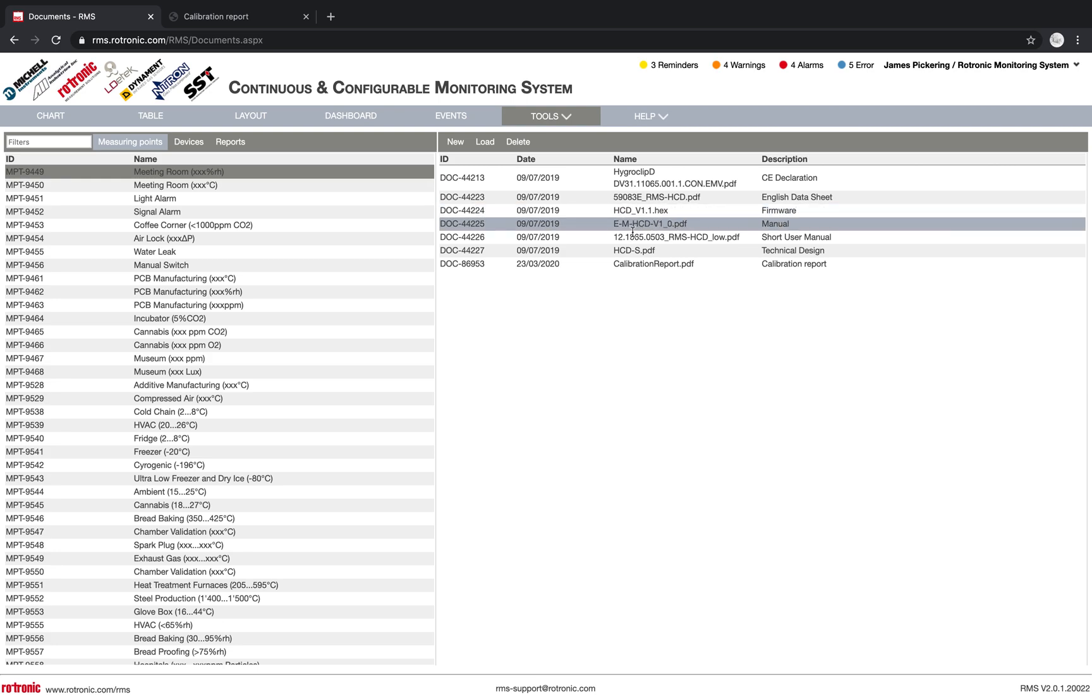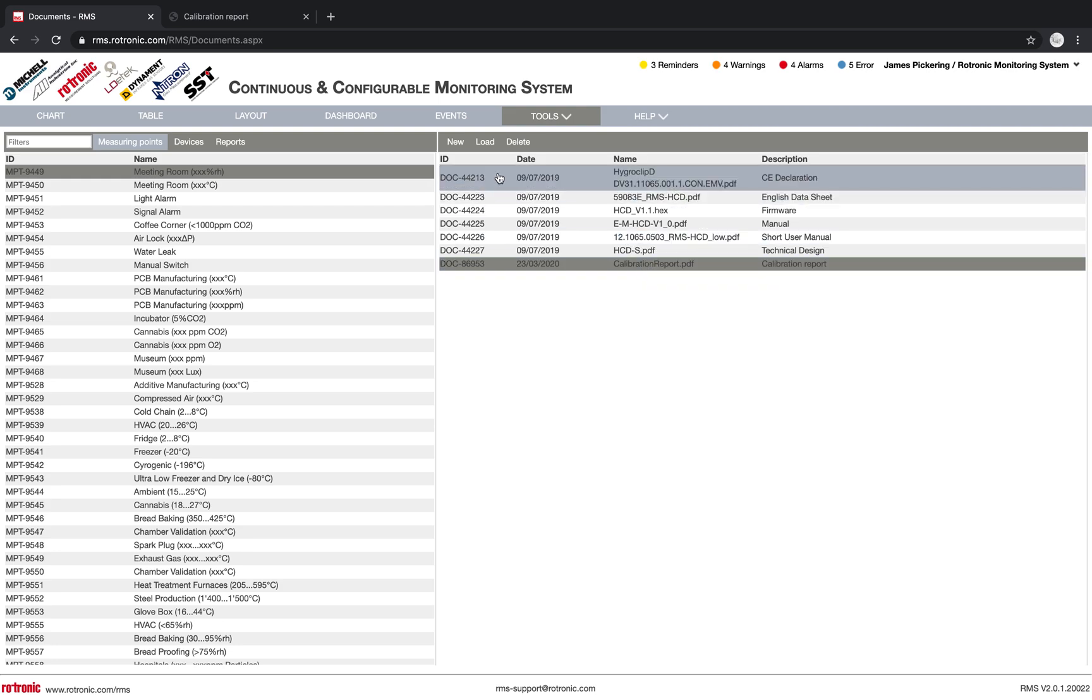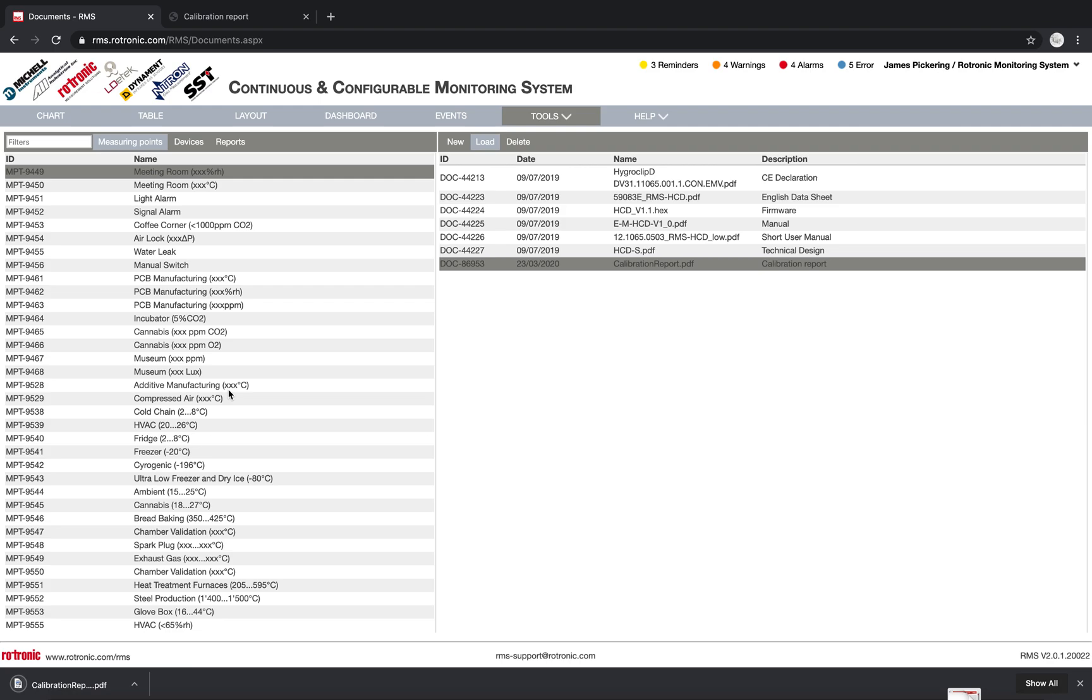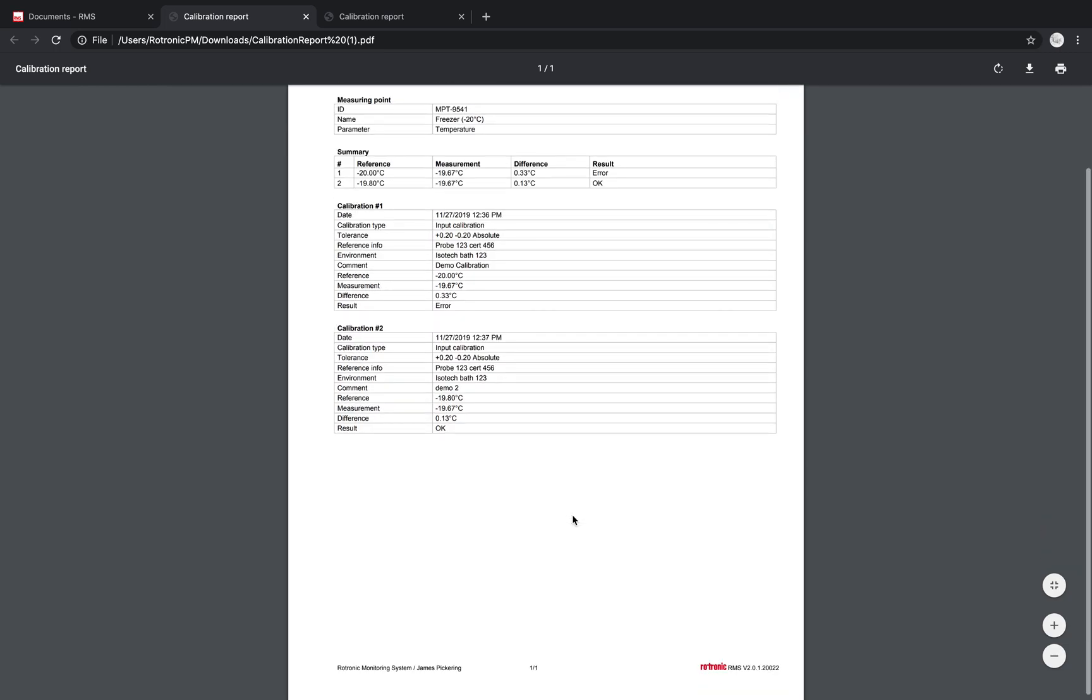A short user manual, the technical design, and as well the calibration report. So we could load this calibration report, and we can see exactly how that probe was calibrated. So here, this one has a two-point calibration that was done on it.